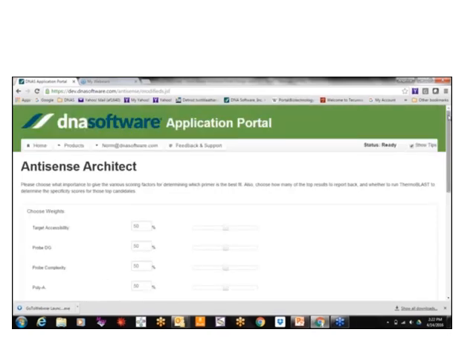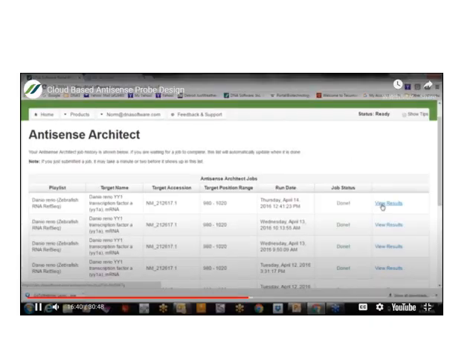After that, we can also adjust the GC content of this probe. We can compromise it, and as previously mentioned, it should be between 40 and 60%. We can use this alignment search tool. Here 50 is fine, it's within the range. After that, we can see our result by clicking on view results.